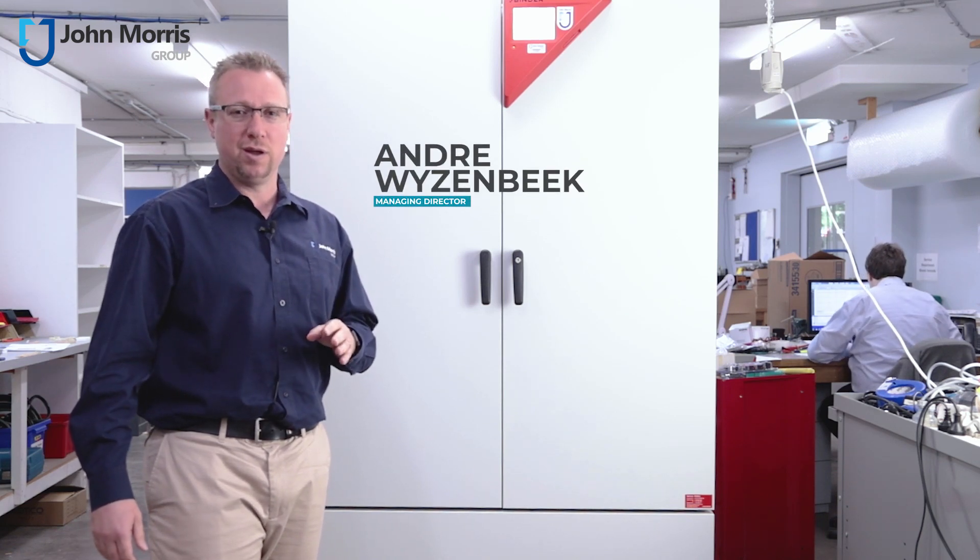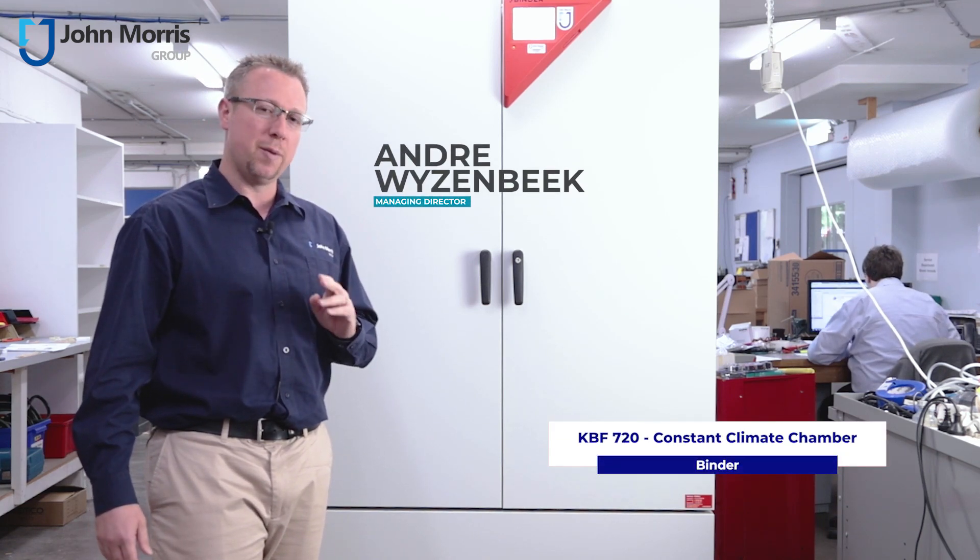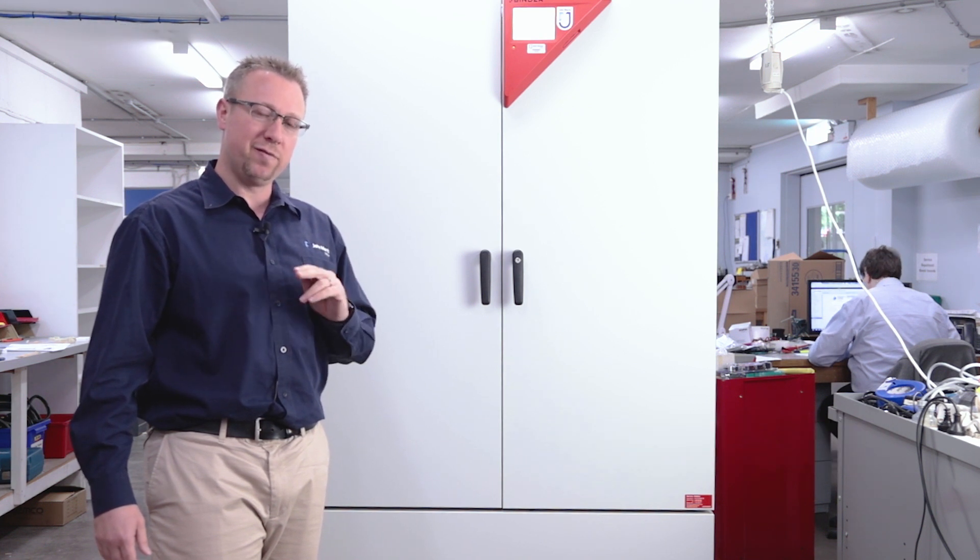Hi, I'm Andre from the John Morris Group, and we're here today to talk about the Constant Climber Chamber, the 720KBF from Binder.